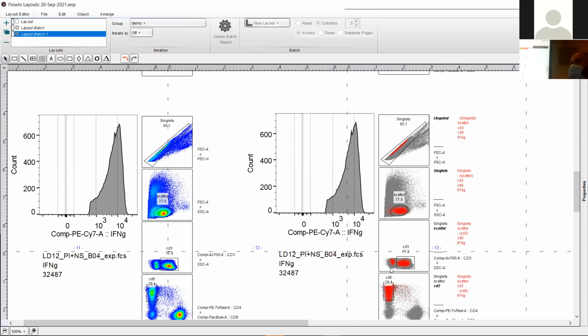Or I could even do it within this analysis. I could just create a gate over CD3 and look for the parameters I have. Although most likely I would need a new panel because I would need to look for monocytes or NK cells, etc. But this is far more valuable than if I just did 3 panels showing my CD3, CD8 interferon gamma, right? So, okay, so first part, that's looking at a very in-depth analysis per sample.